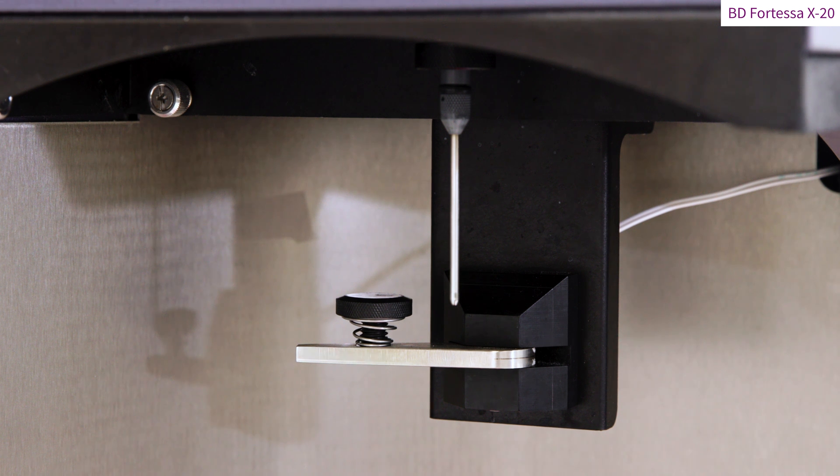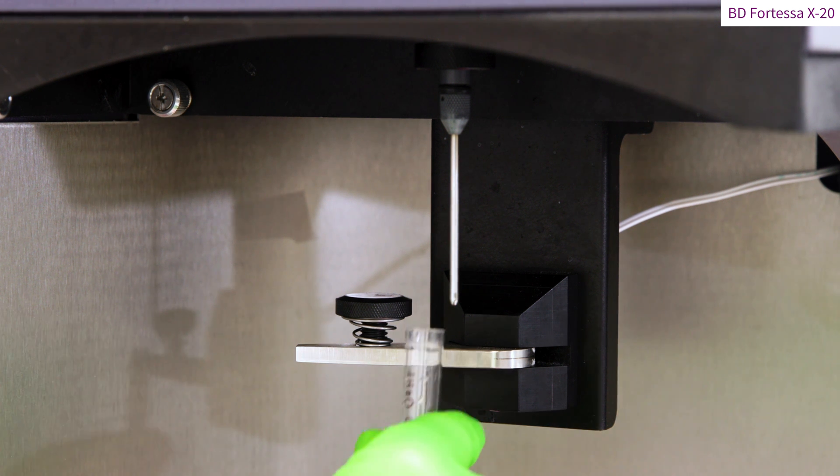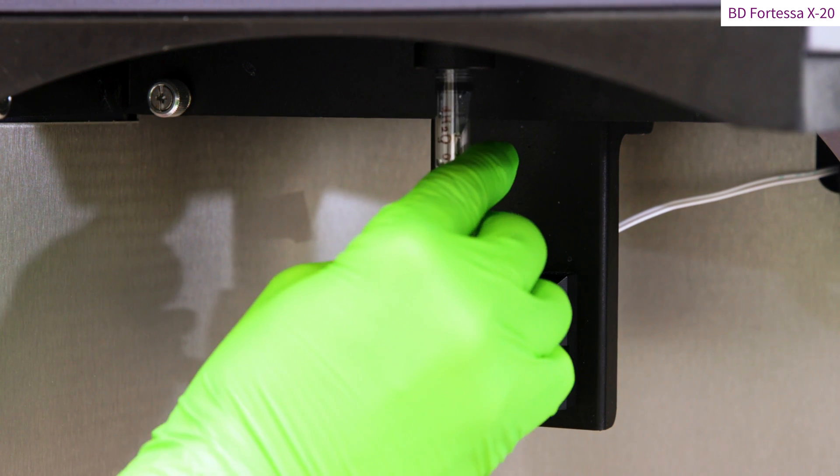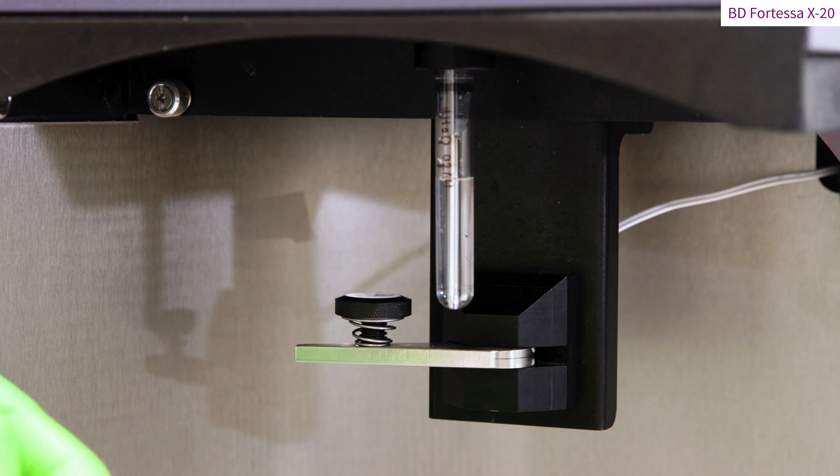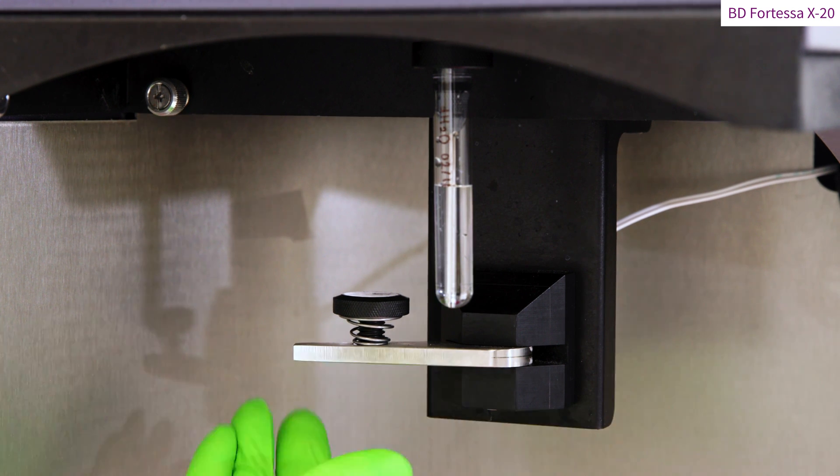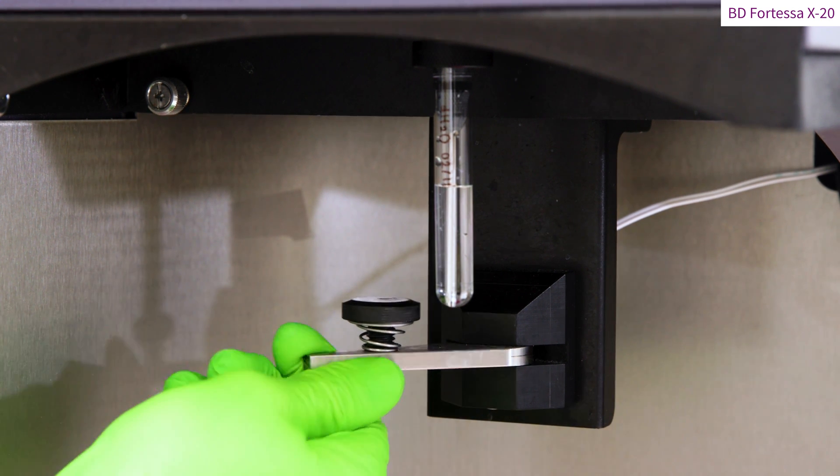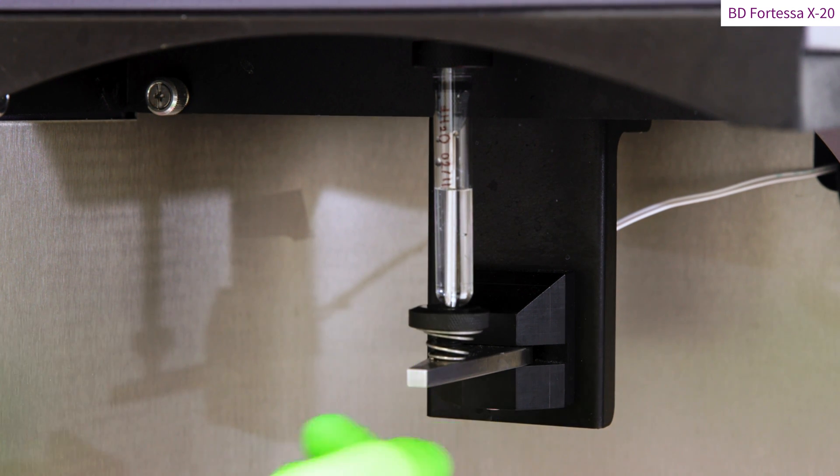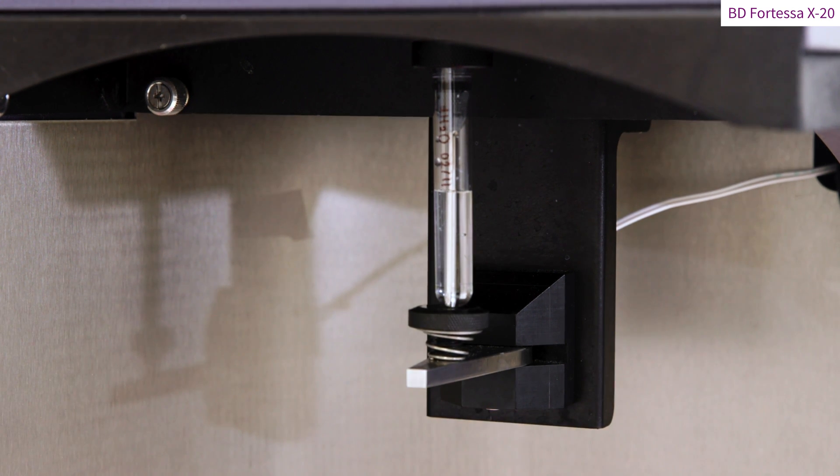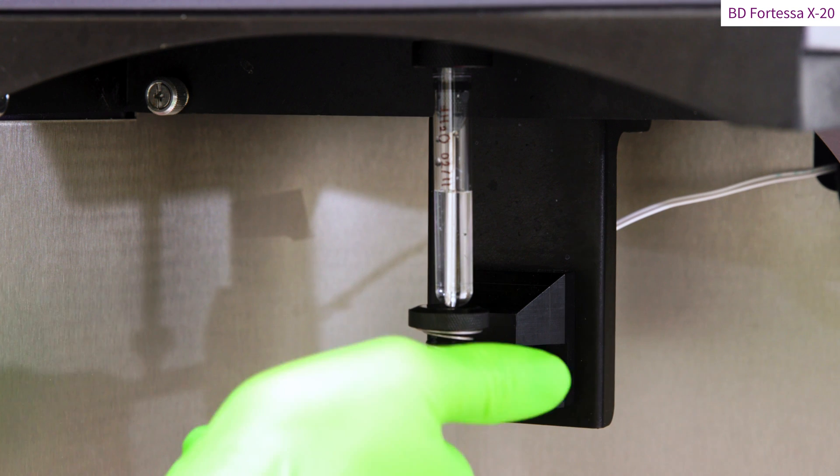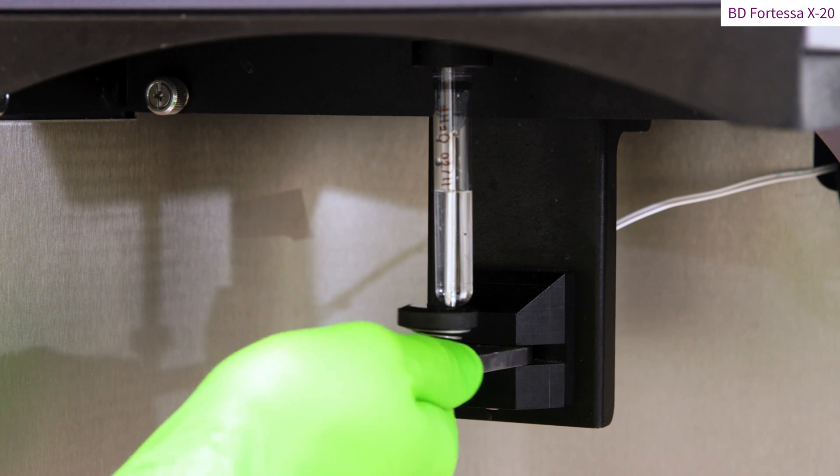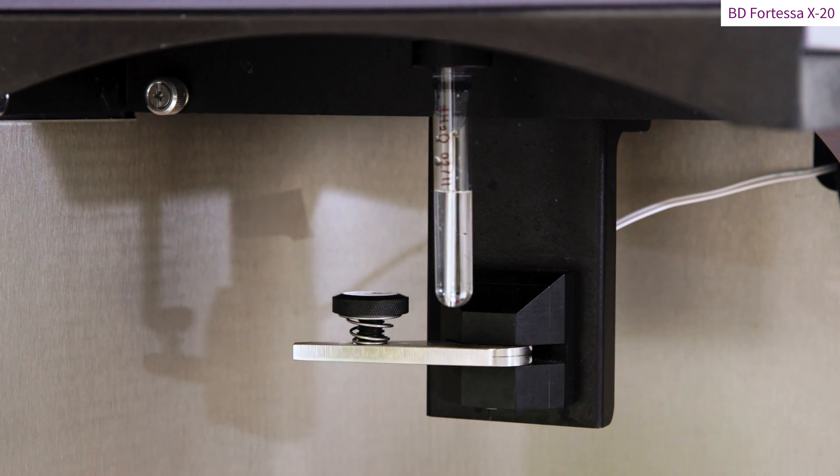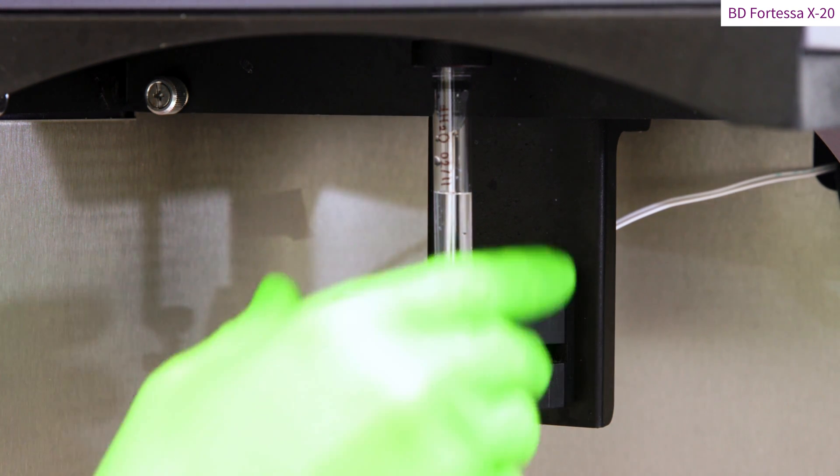Place the tube on the sample injection port or SIP by pushing firmly up. Remember to close the arm or the sample will be quickly vacuumed by the machine. To remove the sample, open the arm and remove the tube promptly.